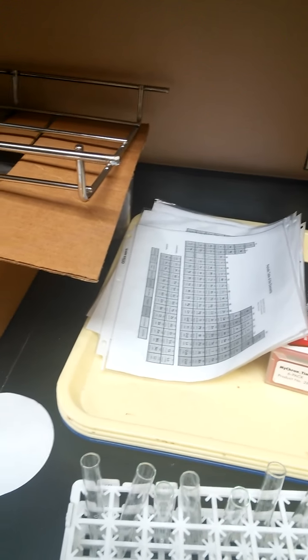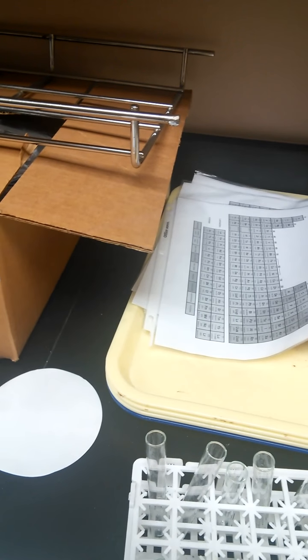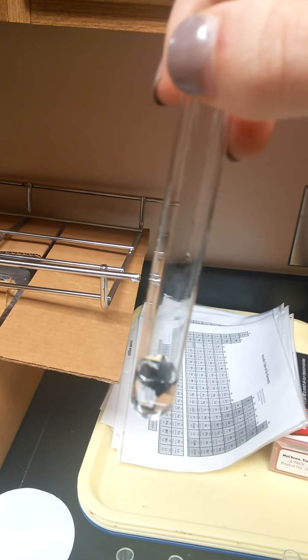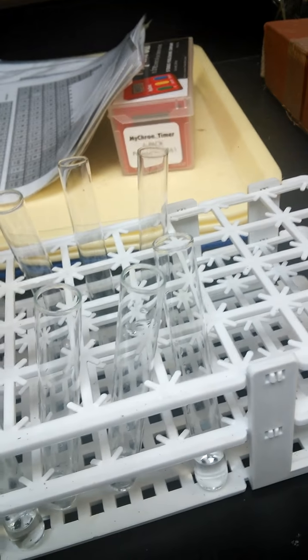Again, copper is not reacting with the hydrochloric acid. Next we'll use carbon. Carbon doesn't look like it's reacting either.